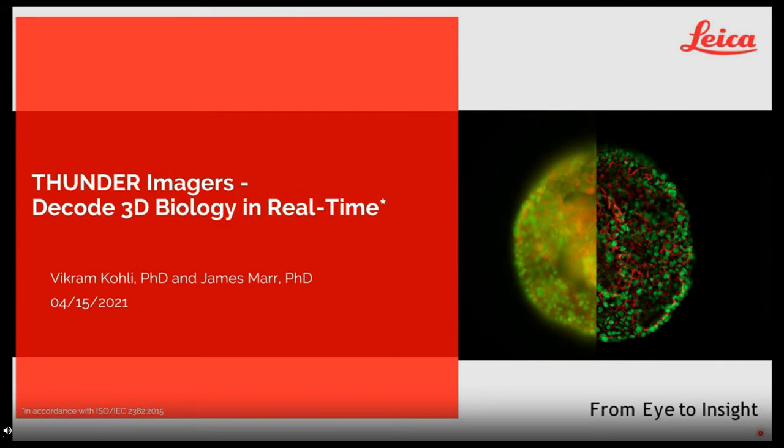Hello and welcome to today's webinar by Leica Microsystems. My name is James Marr. I'll be joined by my colleague Vikram Kohli. Together we are advanced workflow specialists for the North America region. As we go through the talk today, he and I will switch back and forth for whoever is talking. We're going to discuss our Thunder imaging platforms and how they decode 3D biology in real time.